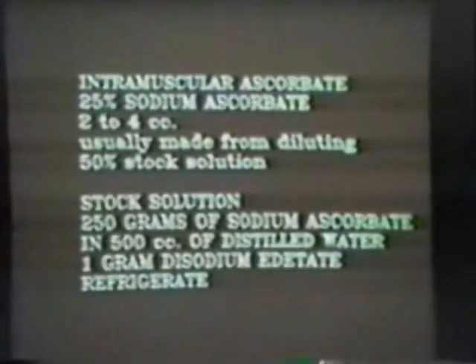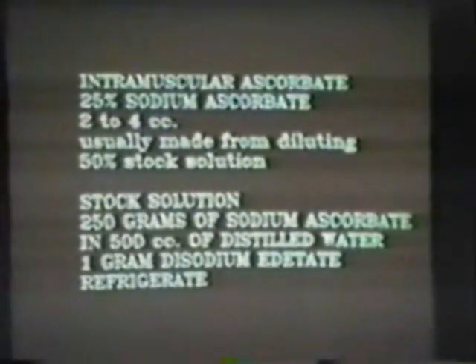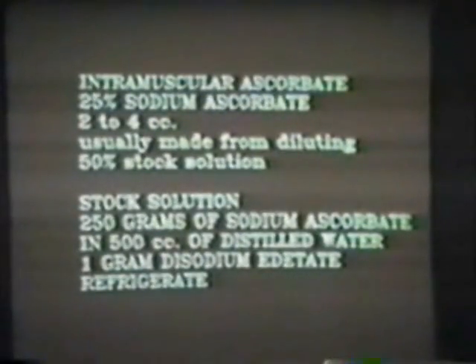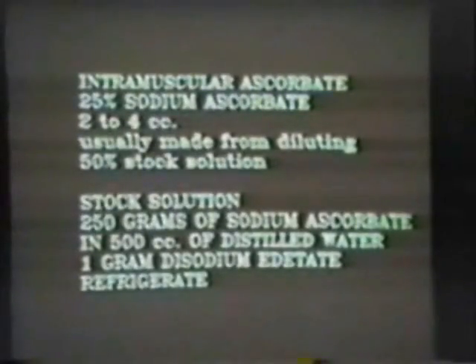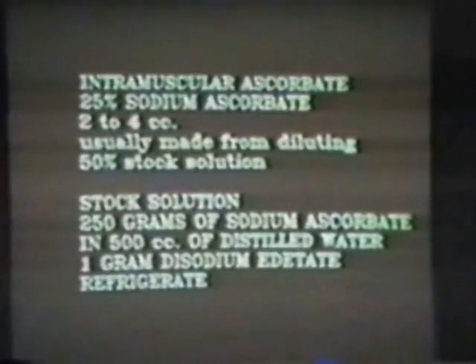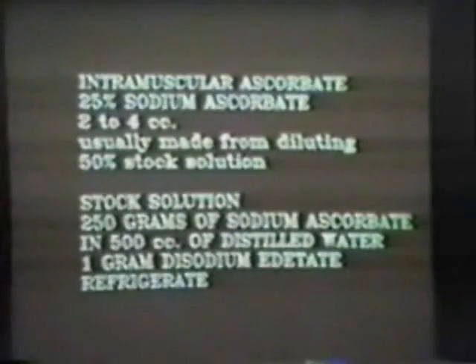I used Bronson's sodium ascorbate powder, and I measured out 500 grams one time and found that it had a dry volume of 600 cc's. So if you're using a 500 cc bottle, you bring the dry powder up to the 300 cc line and then add water sufficient to fill up the bottle, just regular water for injection, up to the 500 cc line.